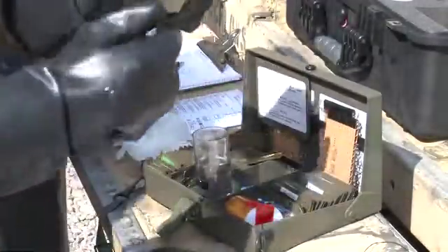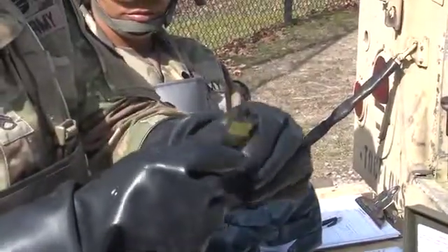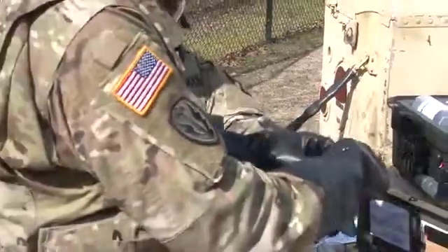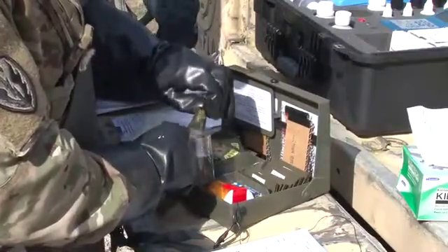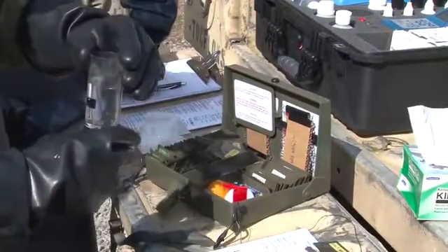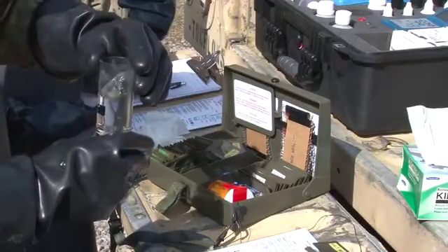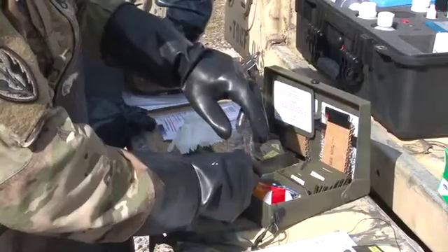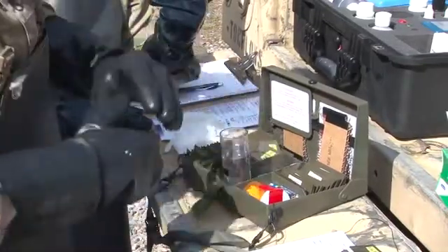Now take one of the yellow labeled salt mix packets from the kit. Loosen the contents between your fingers and tap to the bottom of the packet and immediately add the salt to the water sample in your bottle. Carefully swirl the contents of the bottle to dissolve the salt. You are getting closer to the completion of your cyanide test.